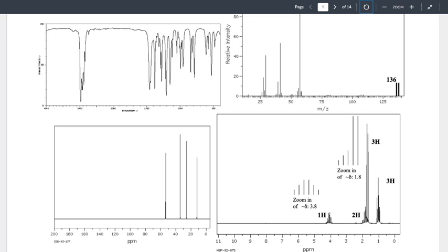Okay, now I did my mild rant. I'm going to call it mild. Let's deal with our color patterns here. We started red here. Blue was those. Orange. And purple. Okay?